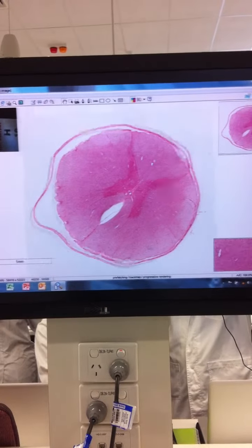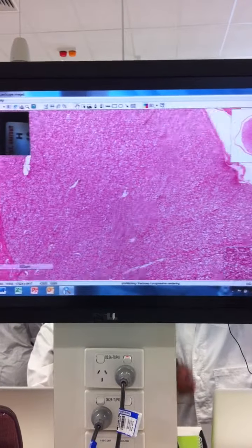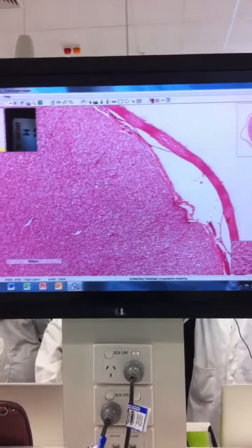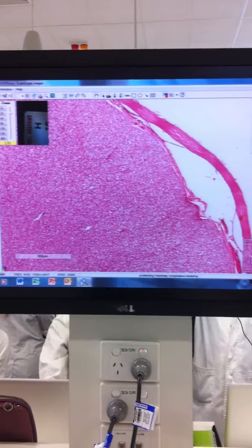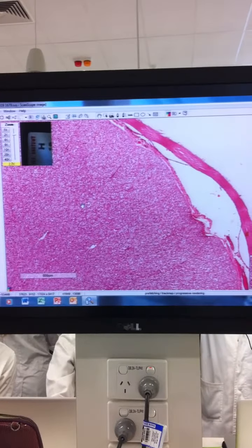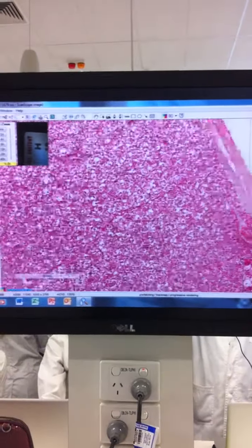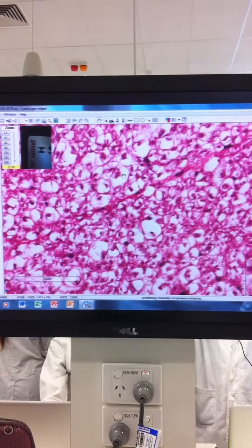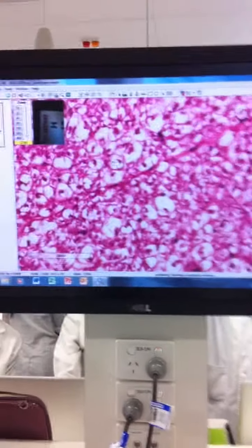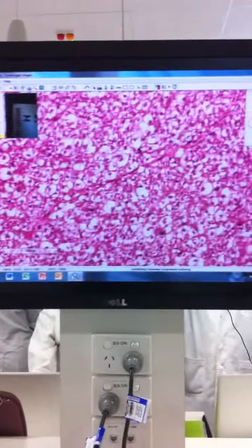So we're just going to look at the top here a bit and look in a bit of higher power. What you're seeing here, as we're looking at this slide, is that it looks almost like a mesh type of arrangement. And that's because all the myelin around each nerve fibre has been lost with preparation. So if we really got close, you can see the processes, the axons, and then lots of spaces where the myelin has gone away. That's why it looks very wispy.